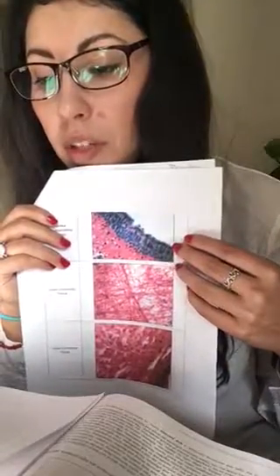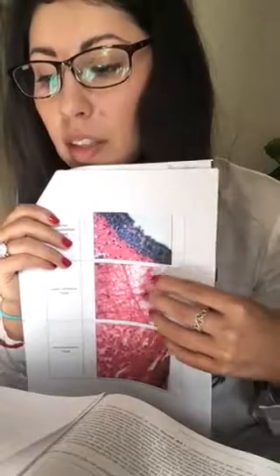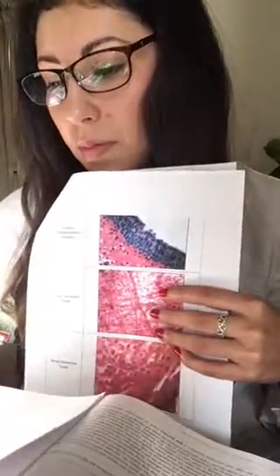On the photography, digitally label the ciliated cells. Use the background as necessary to fill in the remainder of the trachea row on data table 1: the functional type of epithelial tissue seen in the slide, whether ciliated, exchange, protective, transporting, or secretory, and the types of cells seen in the image.